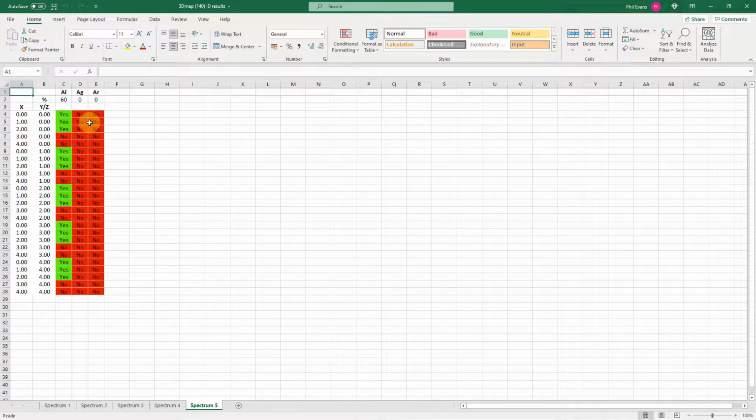The ID results file includes the identification result, the name of each element included, the measurement position on the sample, and the percentage of measurement locations at which each element was identified as being present.